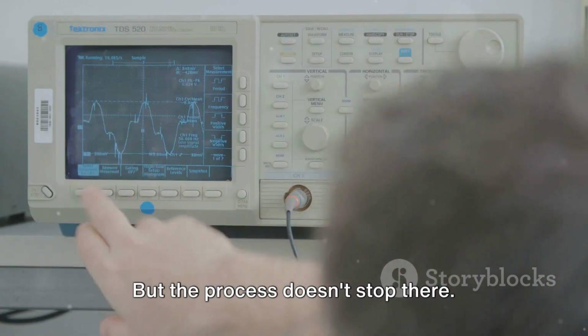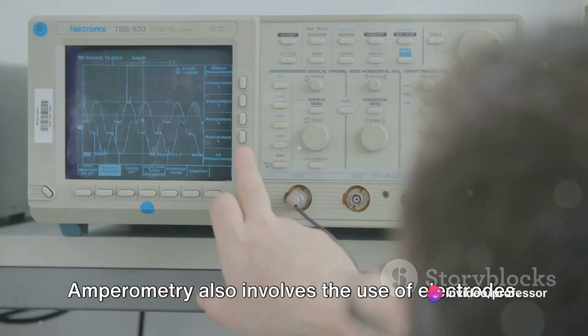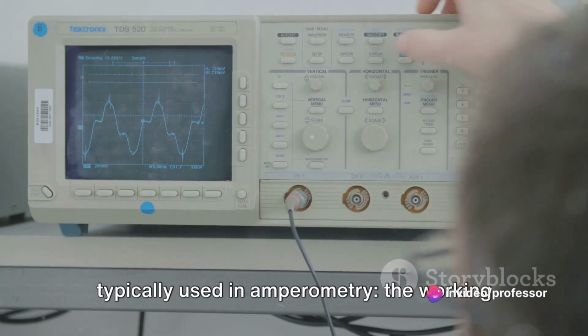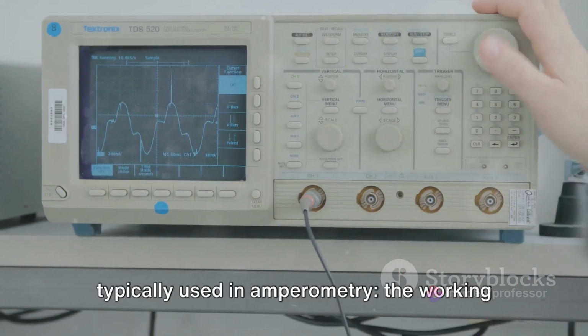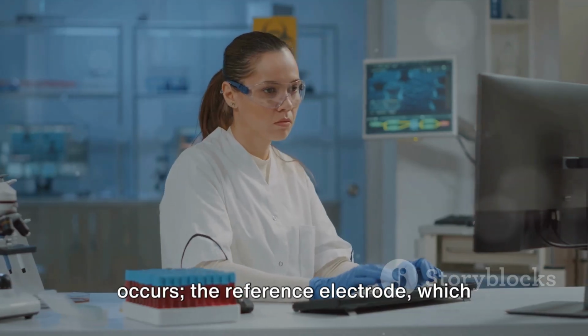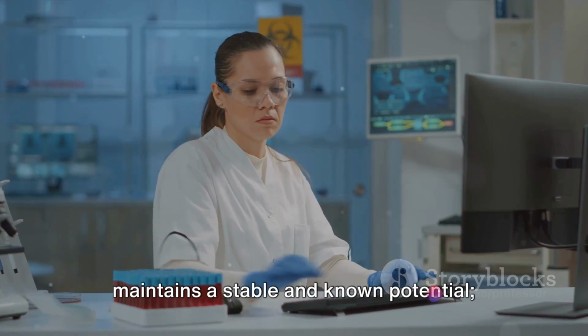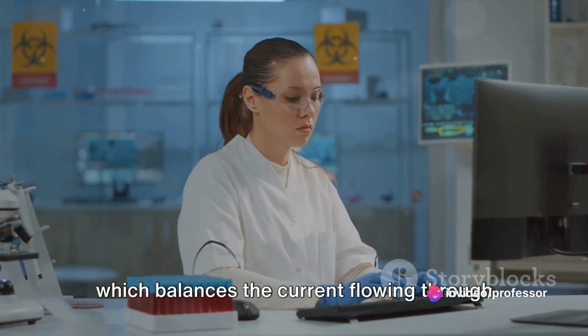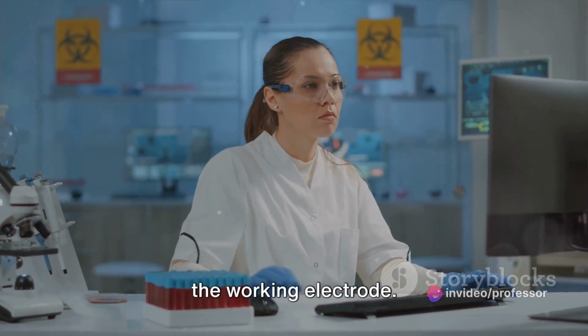But the process doesn't stop there. Amperometry also involves the use of electrodes. There are 3 types of electrodes typically used in amperometry. The working electrode, where the reaction of interest occurs. The reference electrode, which maintains a stable and known potential. And the auxiliary or counter electrode, which balances the current flowing through the working electrode.